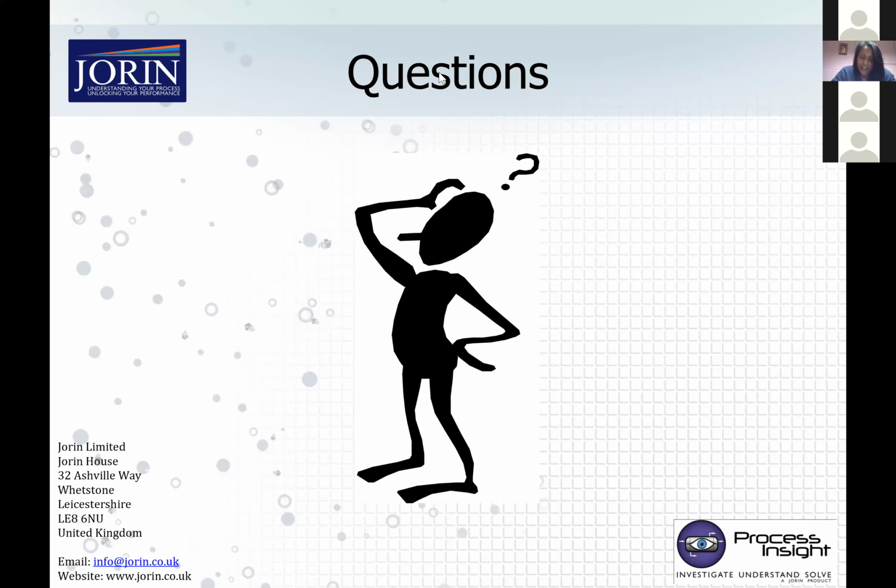So if you did need to analyze, say, downstream separator, downstream cyclone, and your overboard all at the same time, then you would need 3 ViPAs.